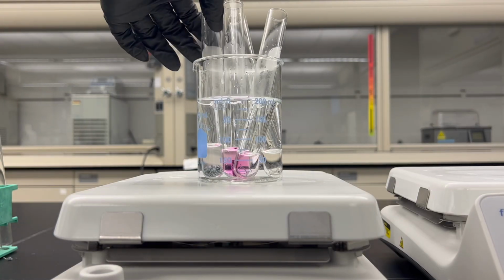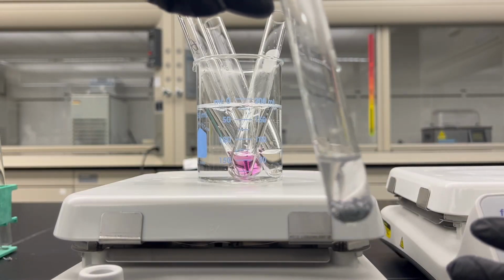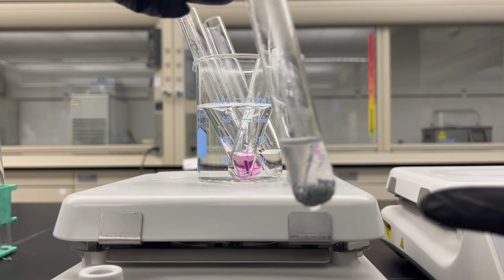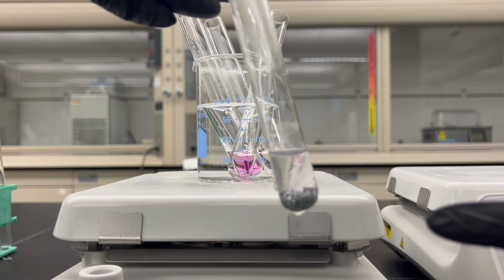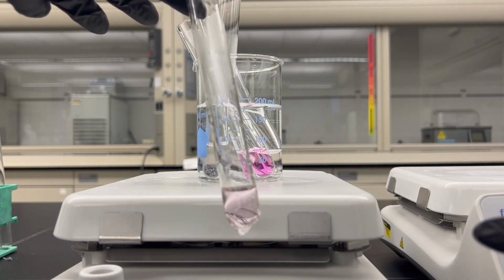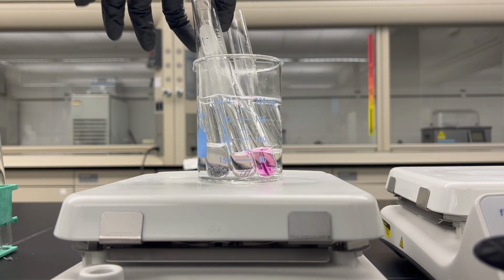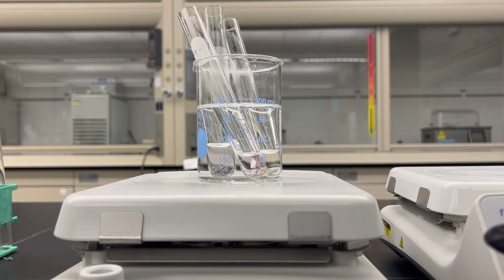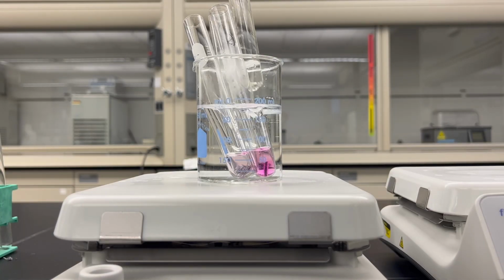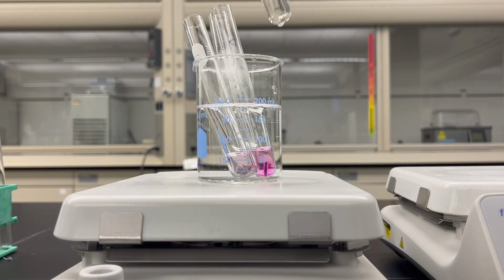Okay, let's take a look at these. So if we look at the zinc, it's kind of hard to see in the camera, but there is a light pale pink hue, especially right around where the zinc is. Next up we have the iron, which is a very clear pale pink solution, so that had a reaction. The magnesium is very clear that it is pink and it reacted. And then finally we have the tin that has no pink to it at all, and it did not react.